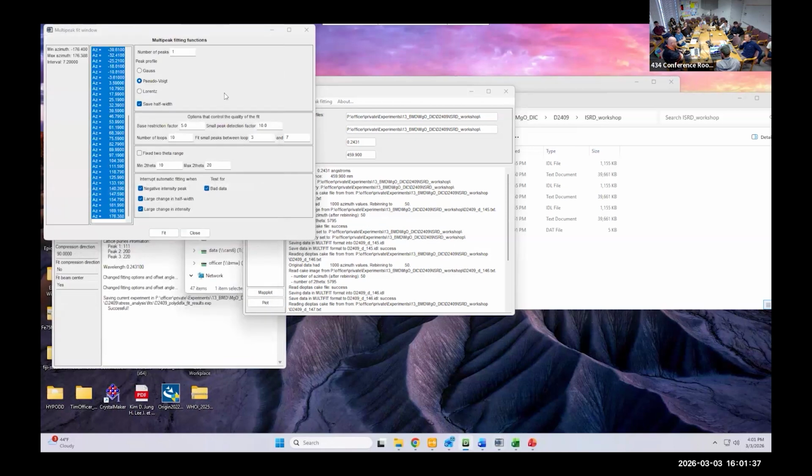And now, to get the pressure, you need to fit at least as many peaks as there are degrees of freedom in your crystal symmetry. So for cubic, the angle between the axes is 90 degrees. So that's set. We already know that. And the length is the same on all three sides. So you only need one. But if you had a triclinic crystal where A, B, and C are all different and the angles between them are all different, then you need to fit 6 peaks.